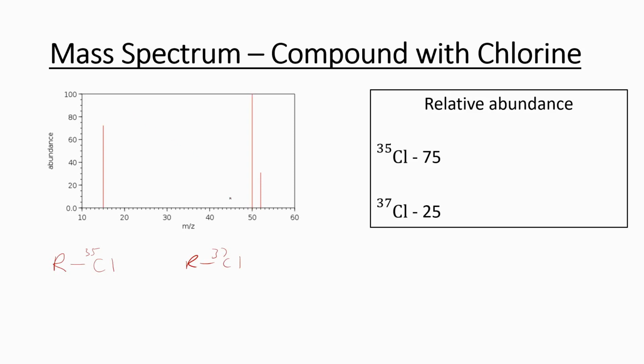So if you have what we call, and this is a molecule, so we can call these molecular ion peaks. Now, a molecular ion peak is a molecule which is charged, and it has the charge of +1. And the molecular ion peak is at the highest mass to charge ratio because it has the highest mass. And so you can determine the relative molecular mass of this molecule.